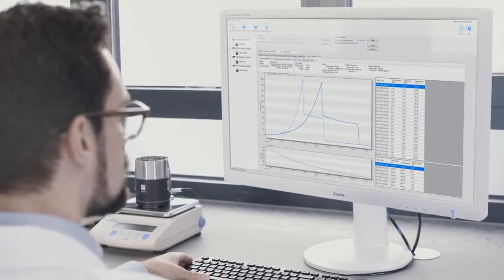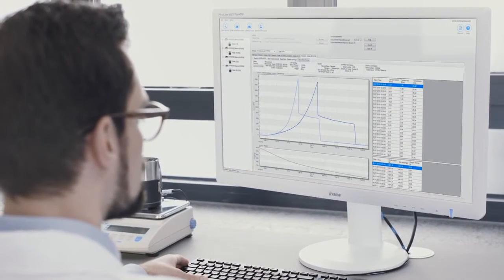The HyProp automatically delivers the unsaturated hydraulic conductivity and wet end moisture release curve.